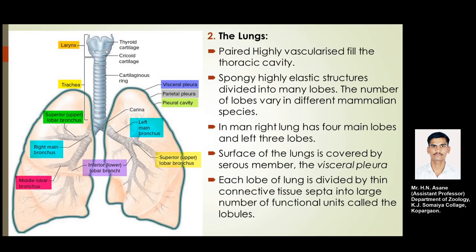The surface of the lung is covered by a serous membrane, which is known as the visceral pleura.